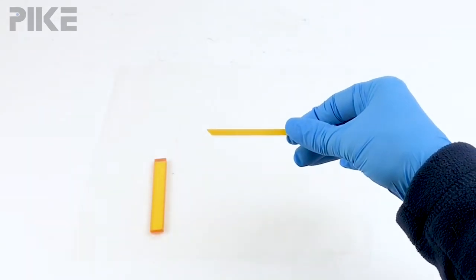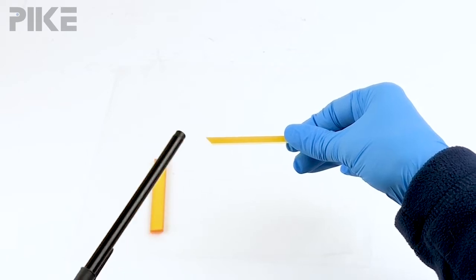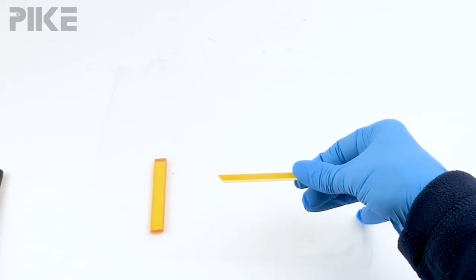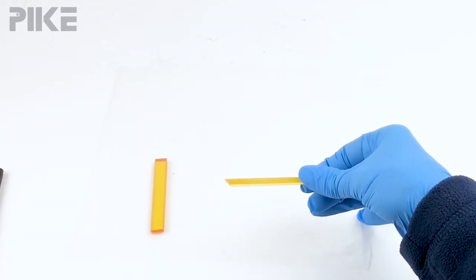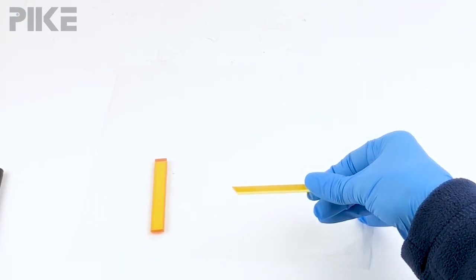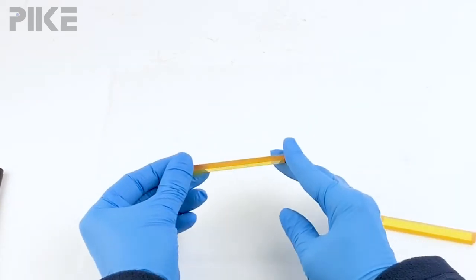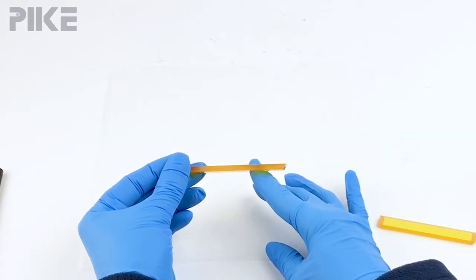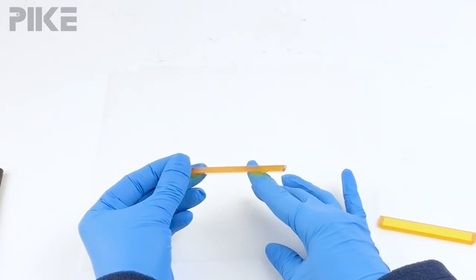If your crystal looks to be about four millimeters thick, we have two options on this face angle. One is 45 degrees and the other is 60. A 45 degree face angle results in 10 reflections on the sample, whereas this 60 degree face angle crystal will result in five reflections on the sample.